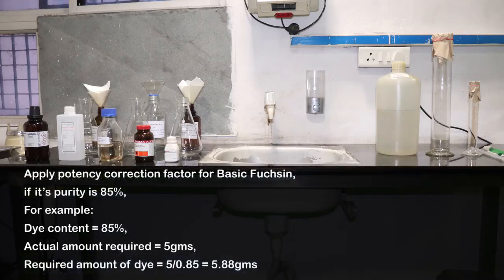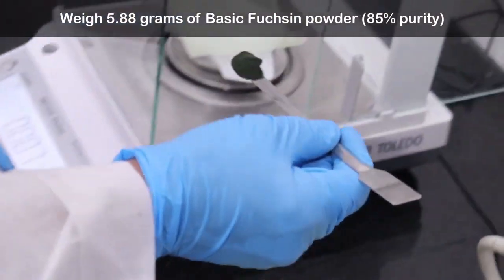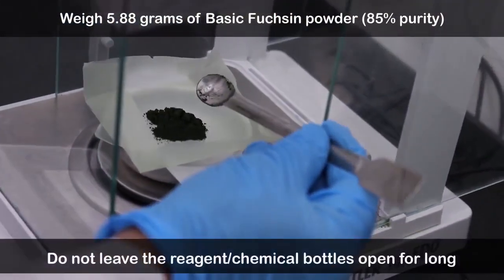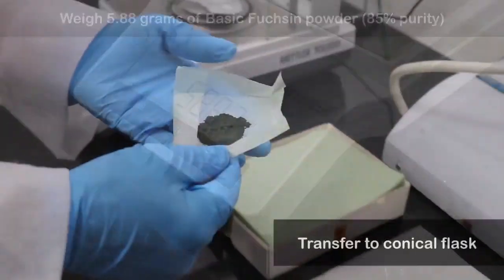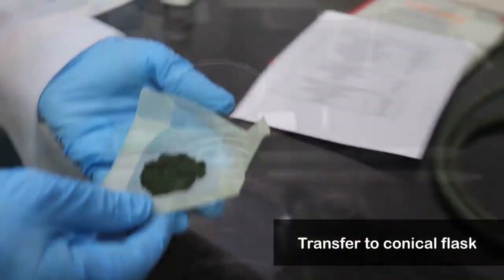Due to variation in purity of the basic fuchsin obtained from manufacturers, potency correction needs to be applied when calculating the amount of dye needed for stain preparation. Weigh the basic fuchsin on a paper board or butter paper.